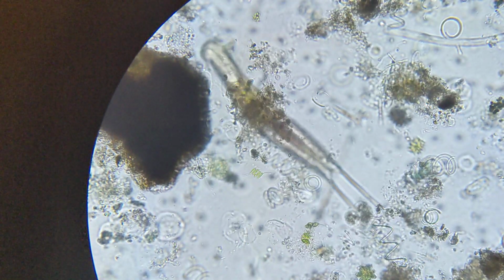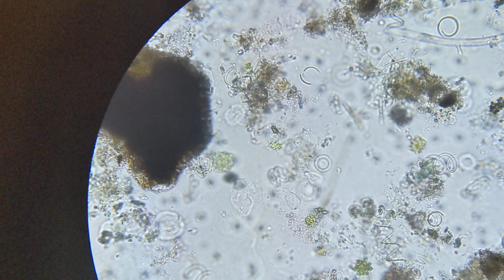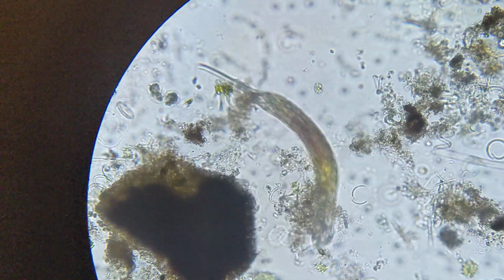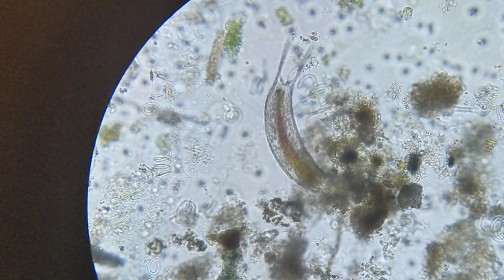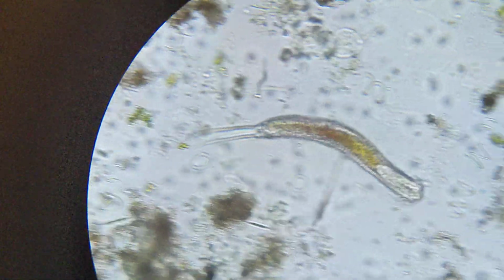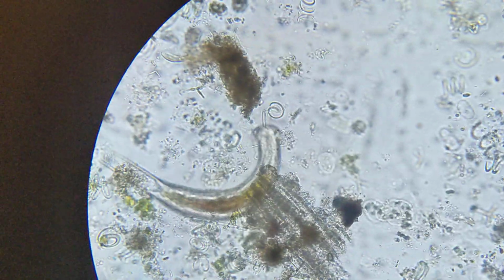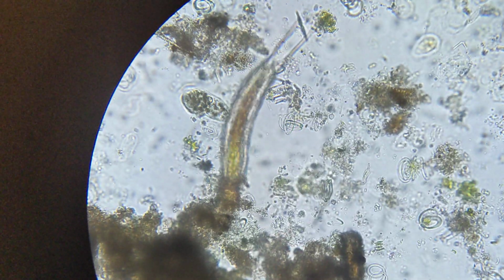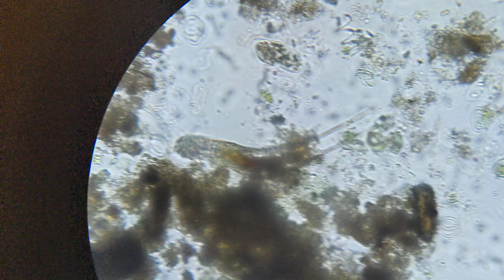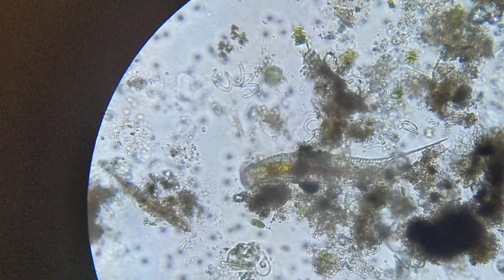Hold on just a moment. I need to adjust something else on my phone. Turn that off. Oh shoot, I've lost it, oh goodness, there it is, okay. Interesting, so you can see it's got stuff in its gut, which is yellowish at the front, moving towards reddish further back. I suspect the change in colors is that it is digesting stuff, and you can see that at the front it's eaten greenish or yellowish stuff, and as it goes further through the digestive tract, whatever is causing that color gets broken down into something more reddish.